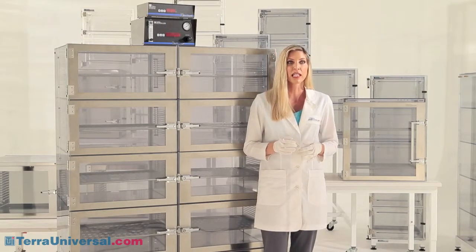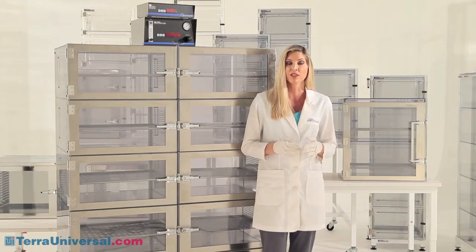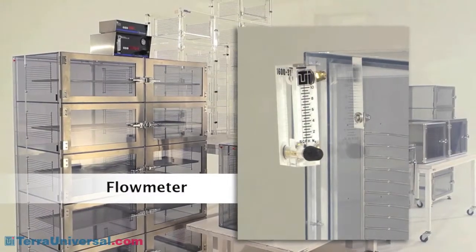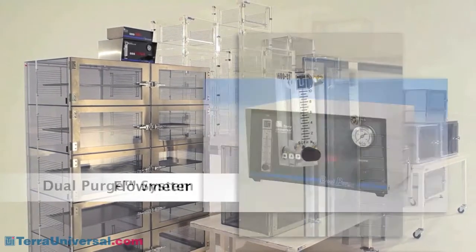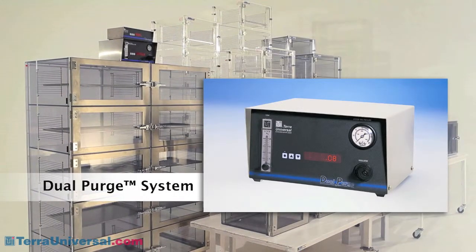Adjust-A-Shelf desiccators allow a number of nitrogen control options to meet various humidity requirements. A flow meter provides inexpensive gas control and is appropriate for use in small cabinets. A dual purge system delivers a variable nitrogen purge — when doors are closed, it restricts flow to conserve gas, but when a door opens, it switches to high flow to remove moisture quickly and efficiently.